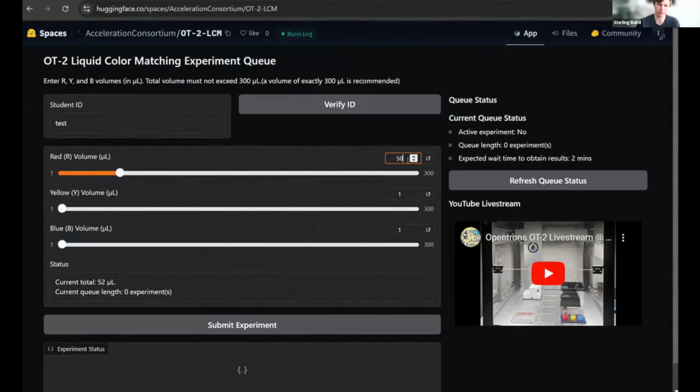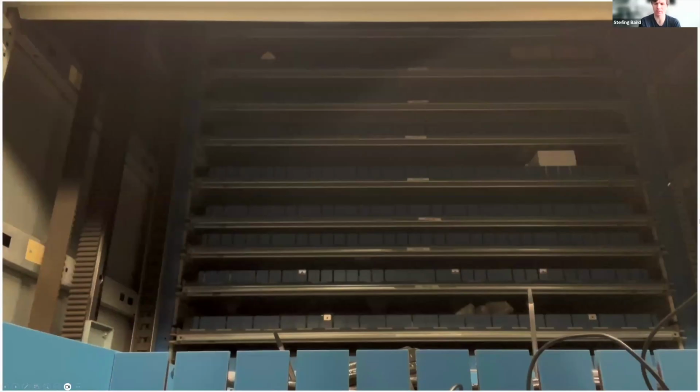And so that's a system we've done some testing on. We're looking at getting one for Brigham Young University. We've done a lot of vibration testing, putting microscopes on here, and overall just vetting this idea. Really looking at utilizing vertical space in an automation-friendly way, not just in a vertical space utilization framework.